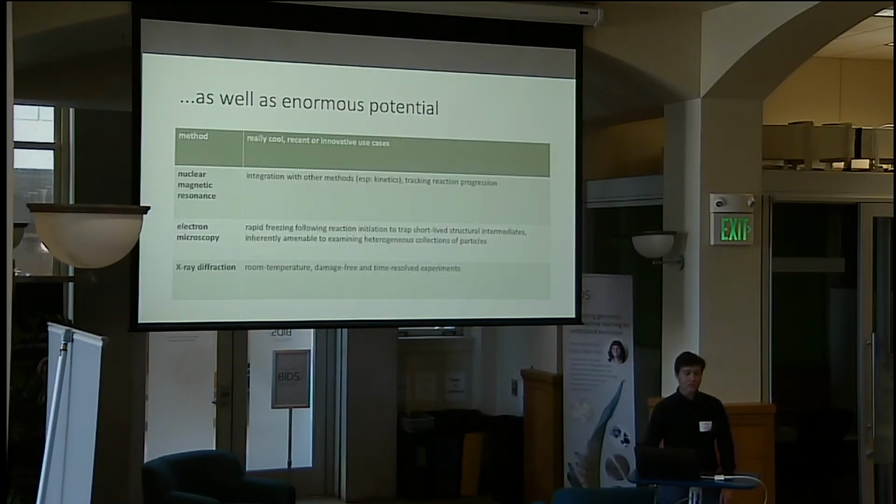Some of the really cool things that we are able to do with these methods: with NMR, if you can take the same sample and collect a bunch of data sets in sequence, then you can track the kinetics of an experiment. And that's something that you can't do with these techniques that will destroy your sample all at once.